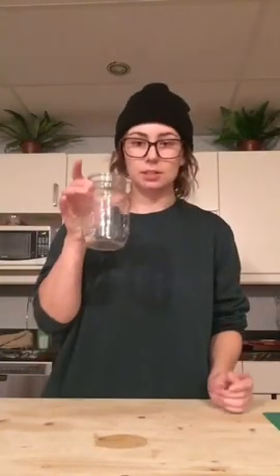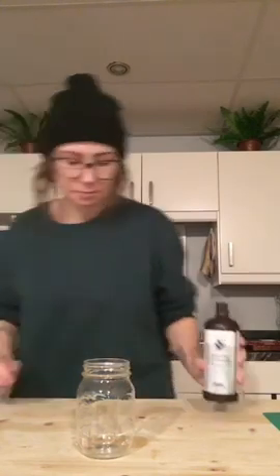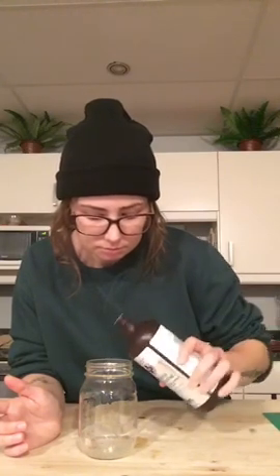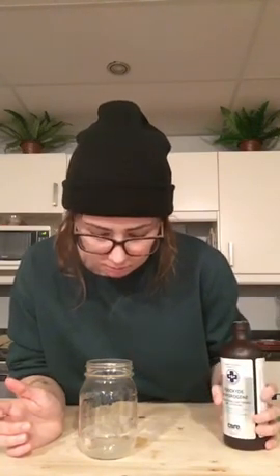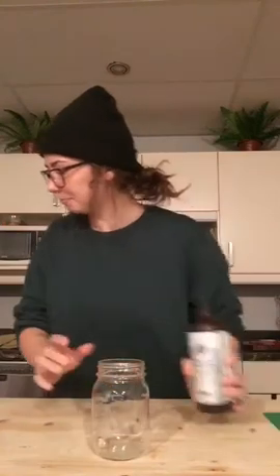Alright, so I have my boiled beef liver in this cup, and I'm going to add some hydrogen peroxide to it. And barely any reaction at all.